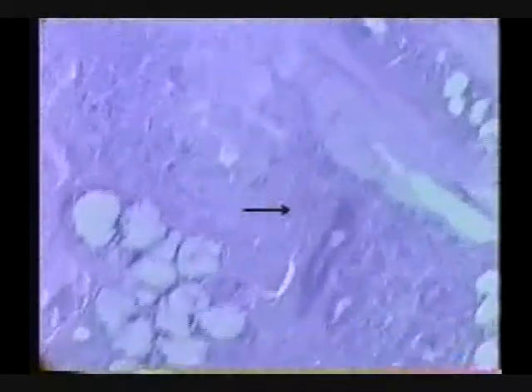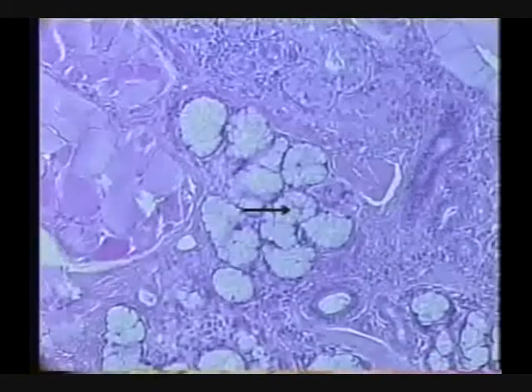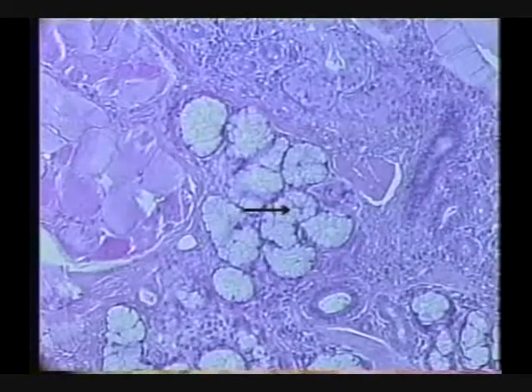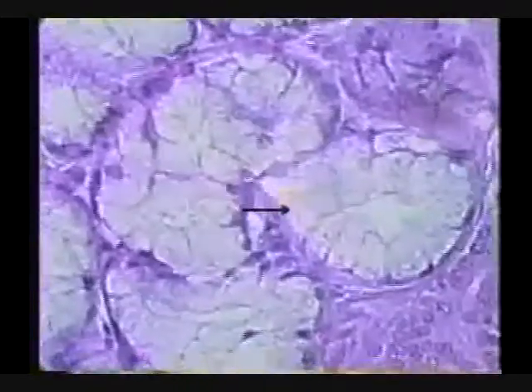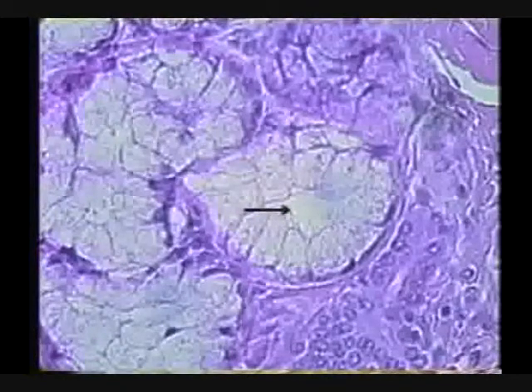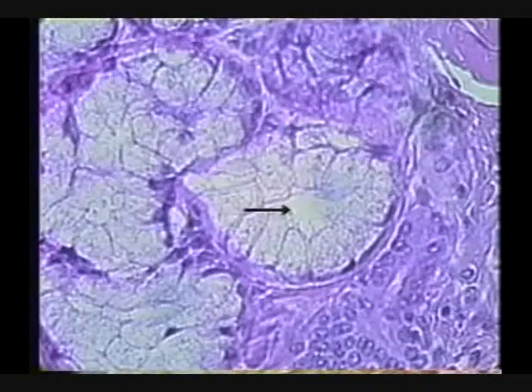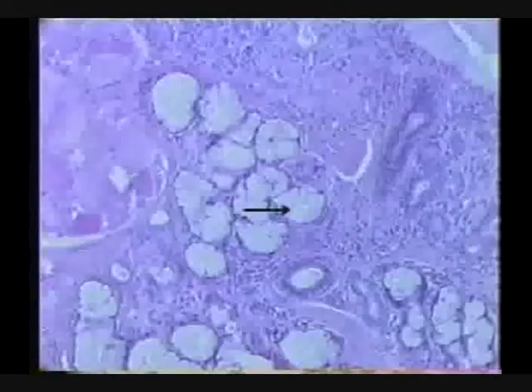Recognize, identify the structures in the vicinity of the arrow. I hear it. Yes, mucous tubules, absolutely. Okay, you're recognizing this stuff.